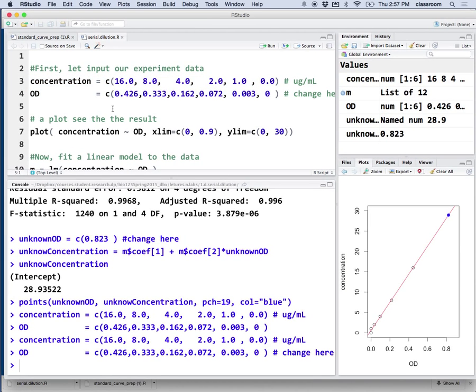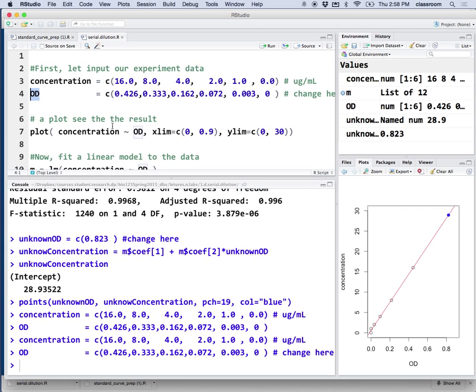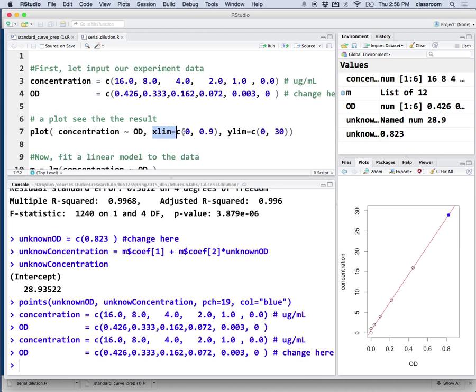So how do we plot them? In R, we just plot, those numbers are called concentration, and the bottom are called OD. So I just plot concentration over OD, the OD will be the X, the horizontal axis, and the concentration will be Y, that's the vertical axis. And you can ignore that, that's basically setting the area of the plotting, the range of X and range of Y.